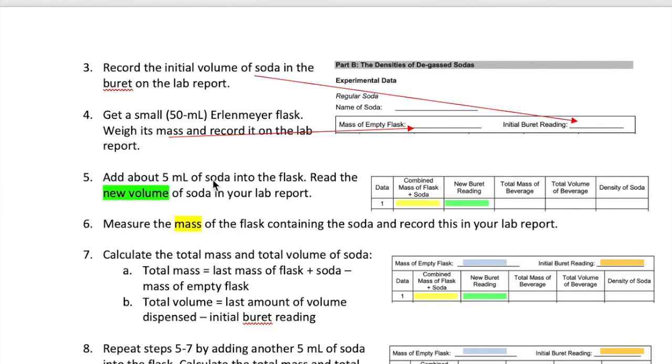Start by dispensing about 5 milliliters of the soda into the glass. Read the volume on the burette and record it in this space marked new burette reading. Then measure the mass of the glass with the soda in it and record it in the space that's marked combined mass of glass and soda.